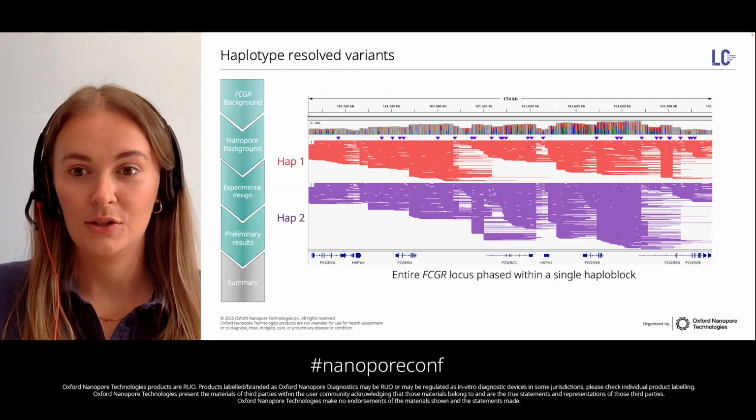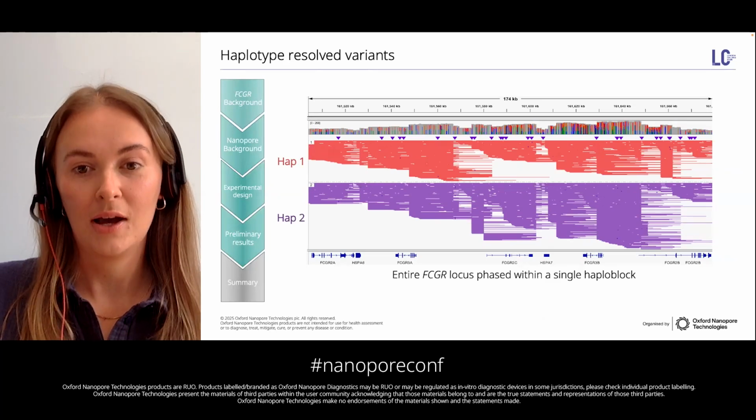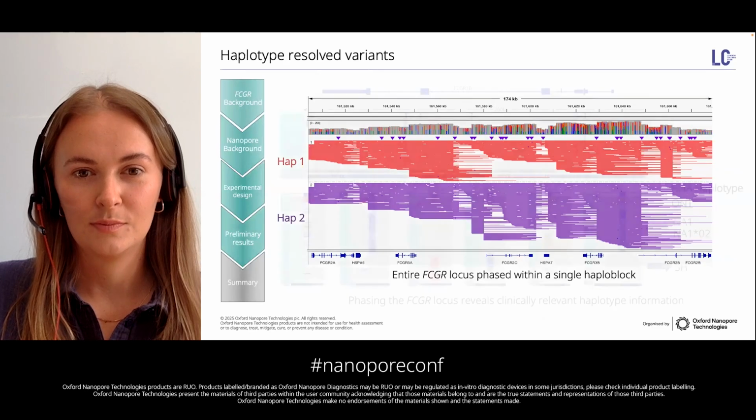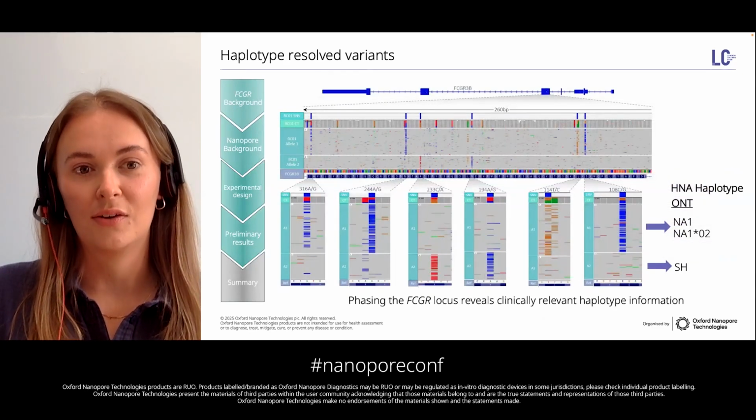with haplotype resolution, providing insight into which variants tend to be inherited on the same allele, and potential linkage disequilibrium relationships. And this makes it possible to explore specific SNPs of interest in greater detail.